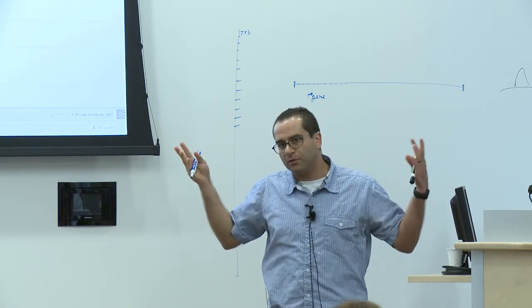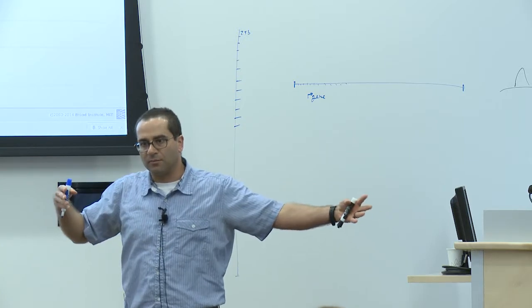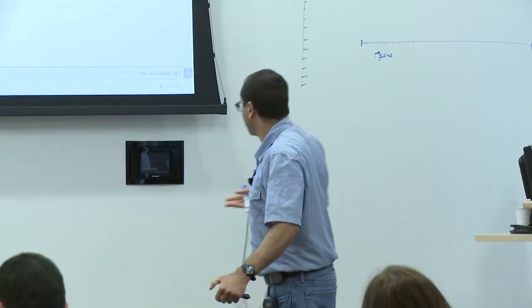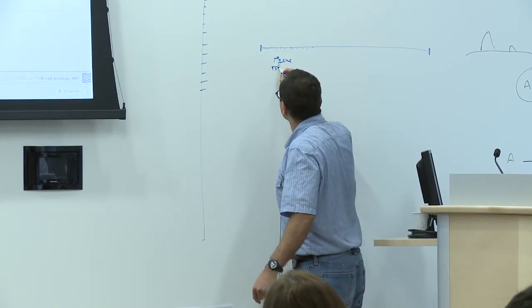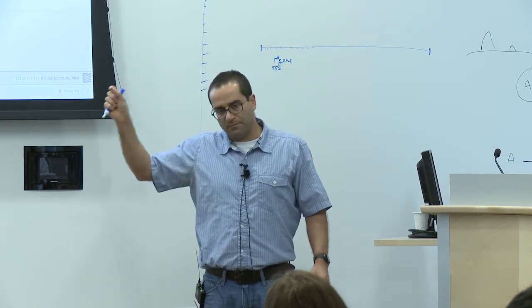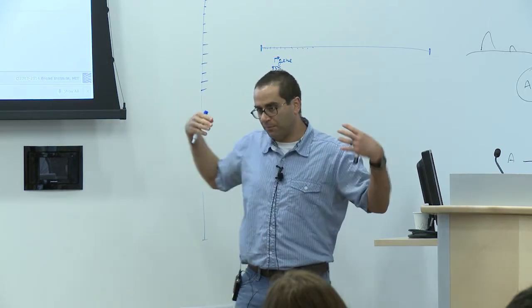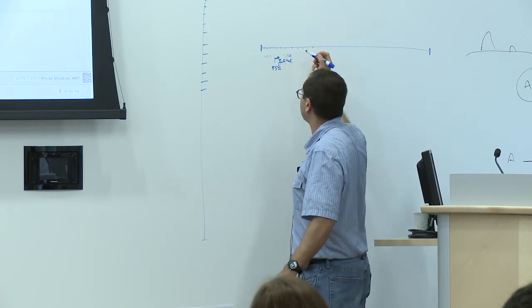And for a promoter, the regular convention is that we take approximately 2.5 kb upstream and downstream from the transcription start site. And so we have 25 base pair bins, and then we do 2.5 kb up and down. So this means that we have 100 bins in this direction and 100 bins in this direction.